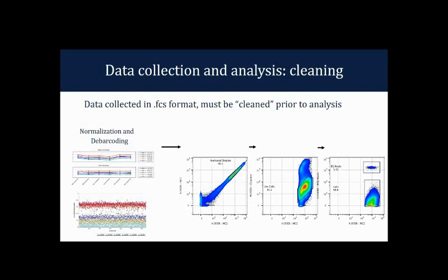We have a nice MATLAB script, and actually there's also a nice R script now, that runs this normalization really quickly, and it levels out the signal across all of your markers based on the equilibration beads that we spiked into the samples initially. We then go through some simple cleanup, much like you would perform in flow cytometry. We gate single nucleated cells based on these intercalating agents.